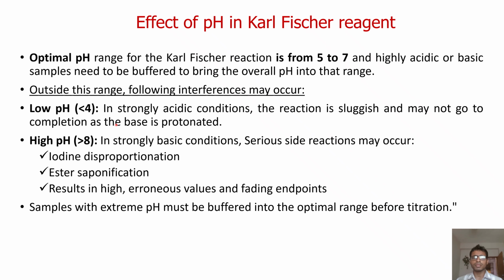You know, our nitrogen base is used. So if our solution or the medium is strongly acidic, then obviously our base would be protonated, because it will receive a proton from the acidic solution. And if our base is protonated, then it will not go for any reaction, because we have used our base for formation of the complex, for the reaction to proceed smoothly.